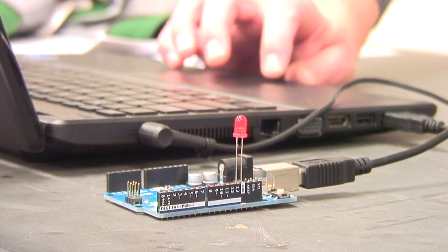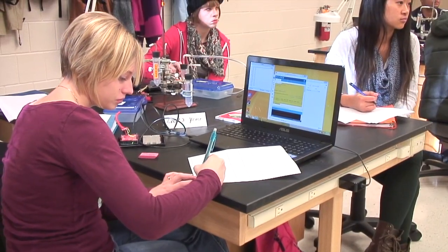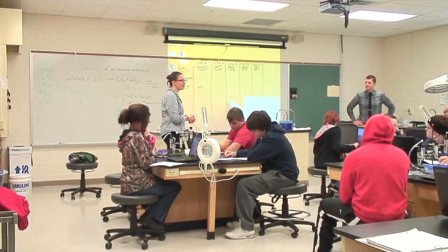The whole point of doing the STEM Sense project was to connect students with science and technology in the form of instrumentation. In the CO2 lab, we were able to use a modern CO2 sensor and an Arduino microcontroller in order to make CO2 measurements through a computer interface. This updates the standard biology experiment by replacing subjective measurements of bubble diameters of CO2 with empirical measurements of numerical data of CO2 concentrations on the computer screen.